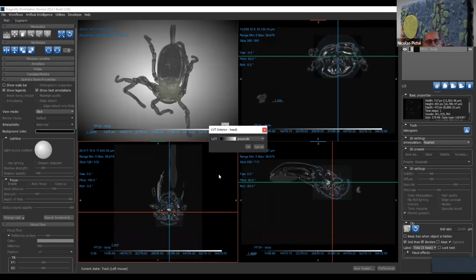Now I'm in a slice view. It's the non-integrated cutting. It's a virtual plane of cut in 3D. The red view is cutting the data set somewhere in space. I can show you where. I will show you later a way to see the cut plane in 3D, the one that is in 2D.